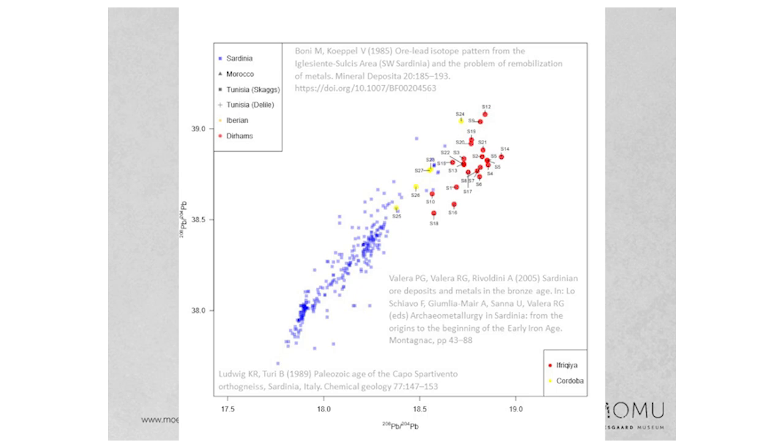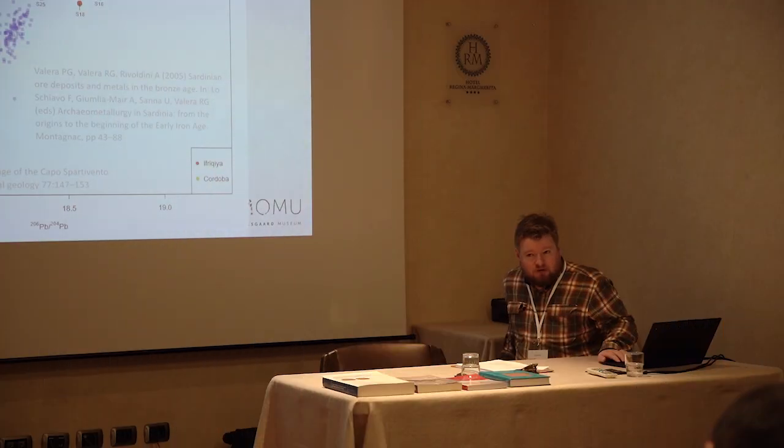So these are almost all of them galena, but there are some deposits where there's still lead in them, which could be some copper ores. But essentially, Sardinia is very distinct, and we've got a few points overlapping, but generally speaking, the red is nowhere near the Sardinian silver. So that's our question answered for the hypothesis.